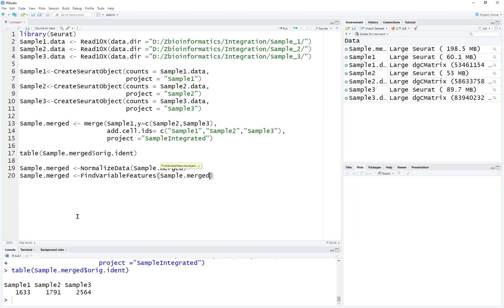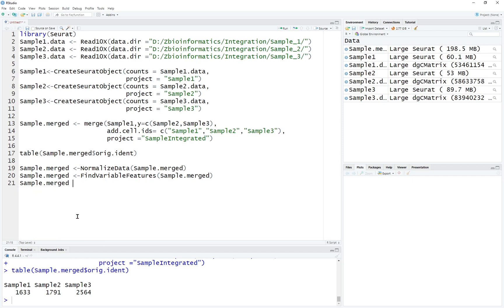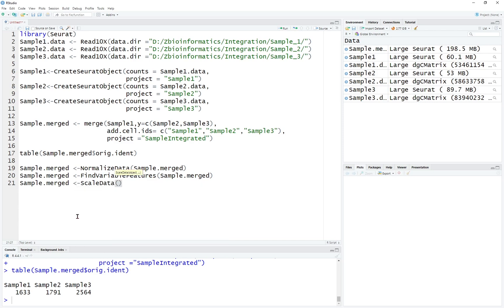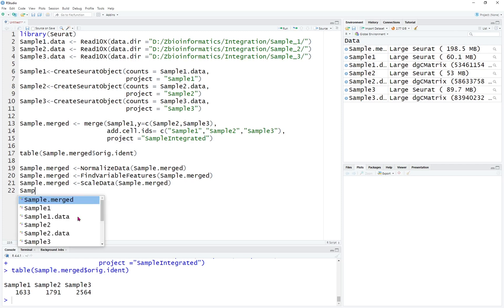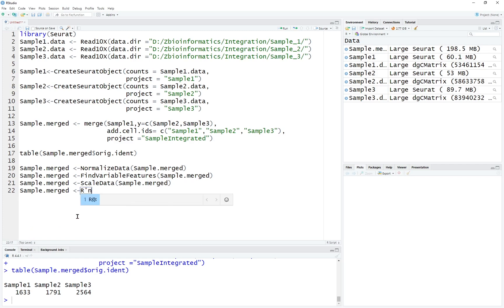FindVariableFeatures will equal sample merged. And after that, we're going to scale the data — ScaleData will also be on sample merged. After that, we're going to run PCA, which is the dimensional reduction — RunPCA is also going to be on sample merged.